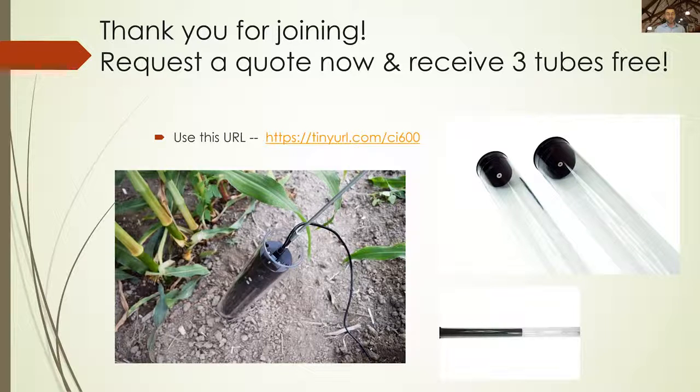So the image size taken in one scan, actually, that's a multi-part question, to be honest. It is measured by just the scanner head of the device itself. So as I already mentioned, it is actually just 34.3 centimeters by 6.35 centimeters for the scanner head on the 600. But when you stitch all those images together, you can get a far bigger picture. When you're changing the DPI, that size of image is going to be the same, but of course you're changing the resolution and the pixel count. So you can get a lot larger data files if you go to a higher resolution.